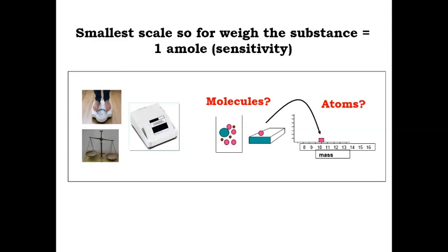Generally, if we want to weigh the body of ourselves, we use a weighing balance. In the past we used a physical balance for weighing chemical substances.